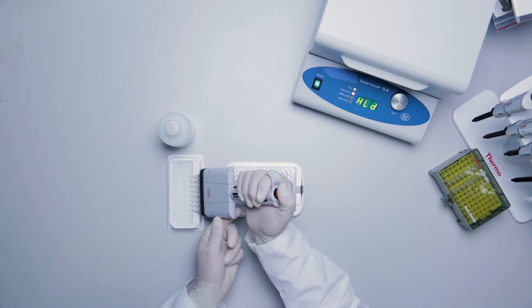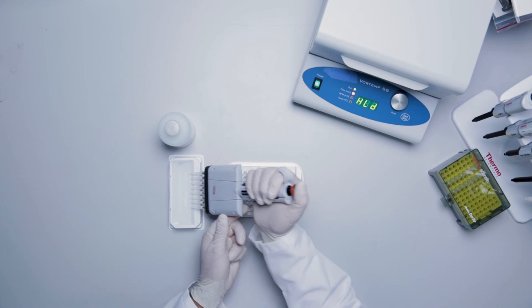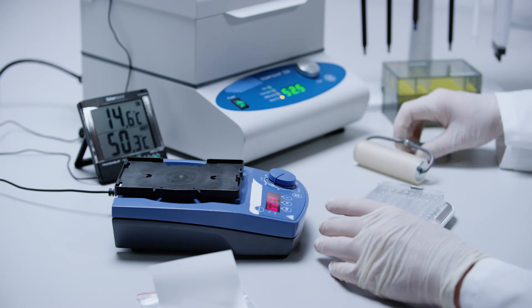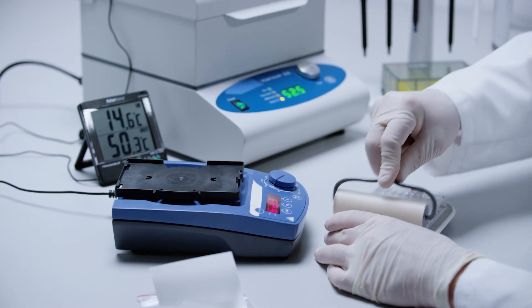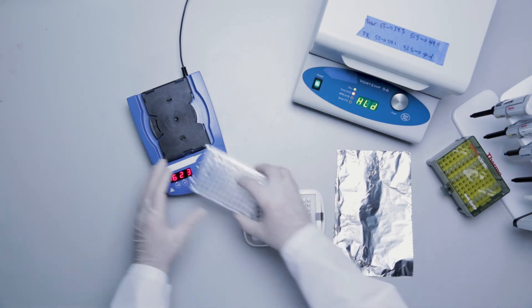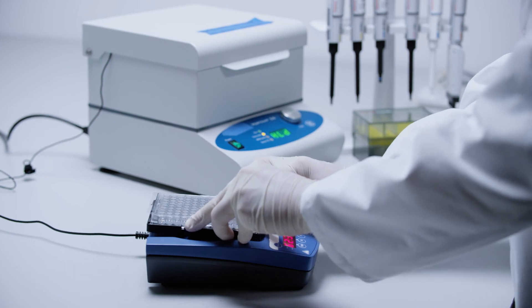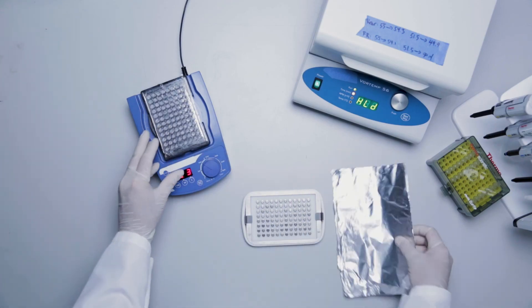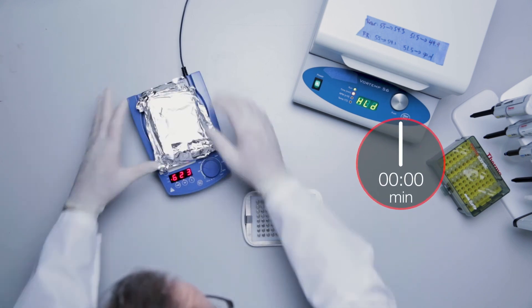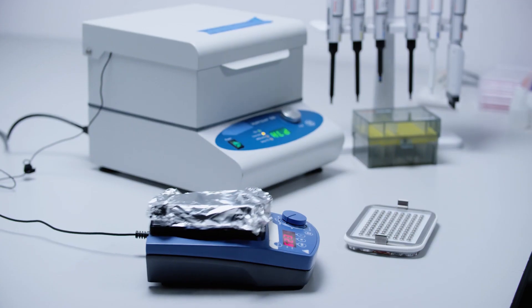Finally, add 130 microliters of SAPE wash buffer to each assay well using a multi-channel pipette. Remove the magnetic separation plate from the handheld magnetic plate washer. Cover or wrap in foil to protect from light and shake at 800 rpm for 3 minutes at room temperature. Read plate immediately on a Luminex instrument.